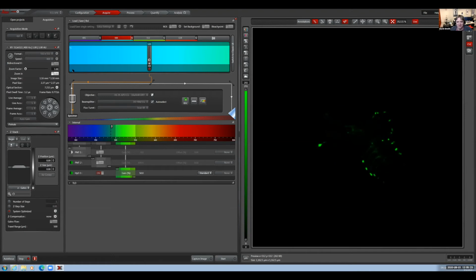However, right. Students will have to use the slider in the software because they can't manipulate those dials. This one works better. The zoom I can change by 0.01 with this dial, but the mouse jumps by quite a bit. Okay. Right. You can type it in. That's okay. Yeah, right. You can double click and type if you want something specific.